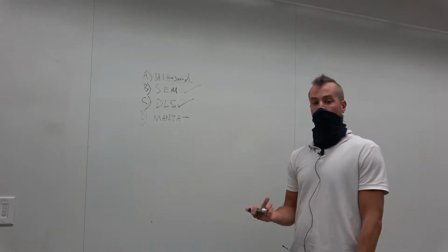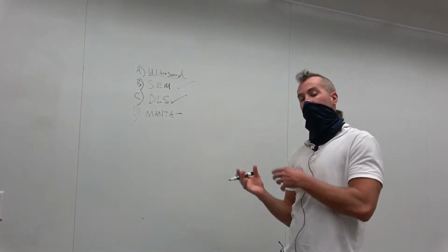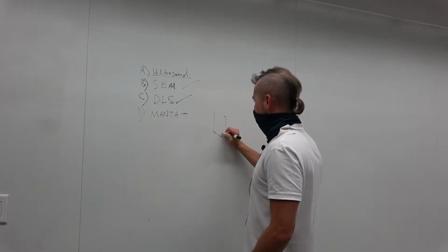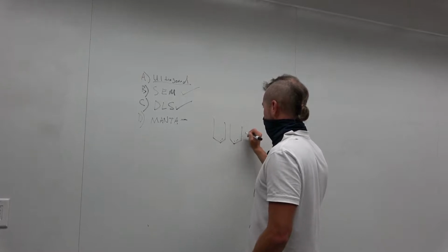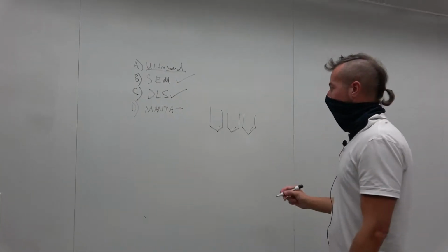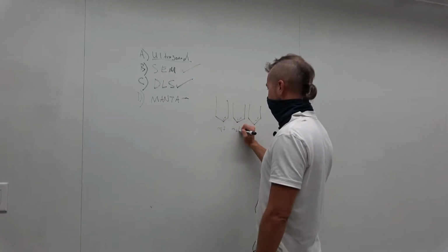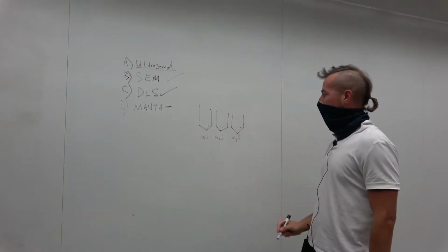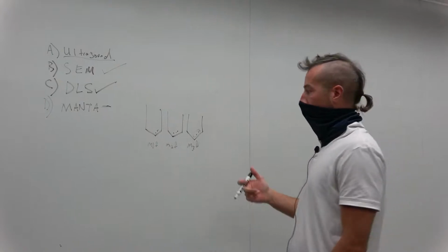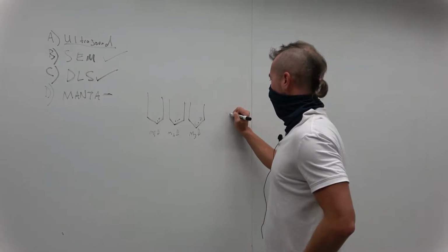In the lecture overview, I talked about this quite extensively, but the first thing we're going to do is remember at the end of day 1, we had 3 little tubes, and so now they'd have dried particles in the bottom. And so now we're going to measure the final mass. So M1 final, M2 final, and M3 final. And we know our mass of particles, and we know the volume we added, so we're going to get a concentration of particles in milligrams per mil.